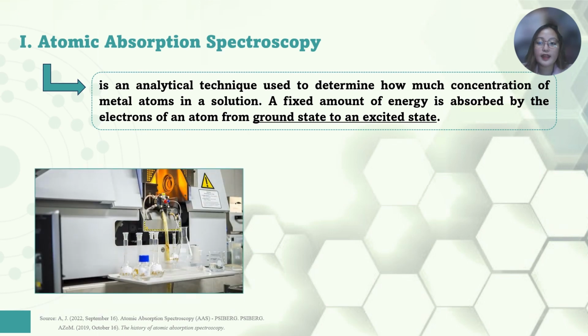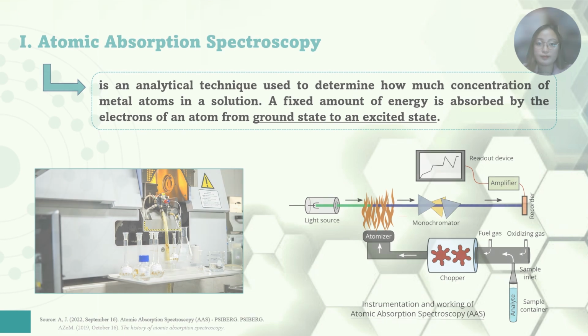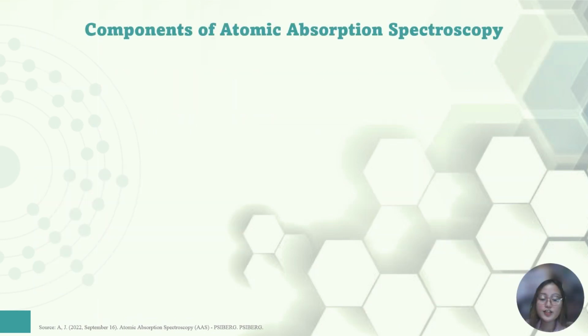This is an AAS in the actual laboratory setup. On the other hand, this is a diagram of atomic absorption spectroscopy wherein the sample is analyzed in the form of atoms.